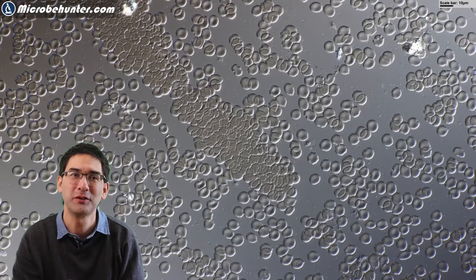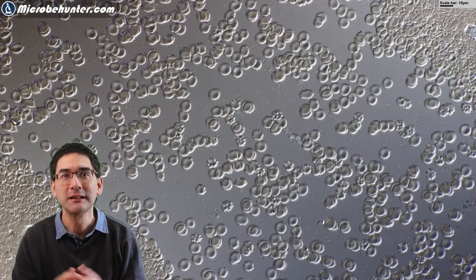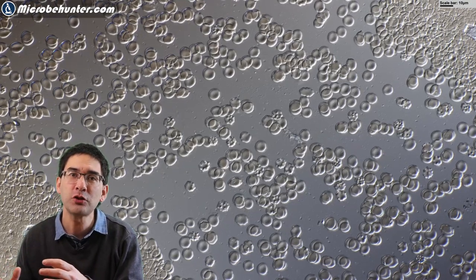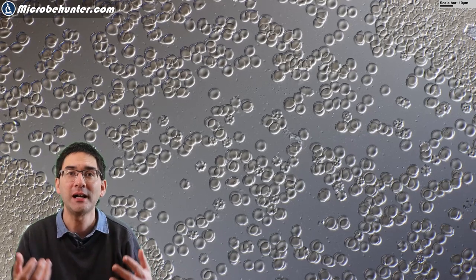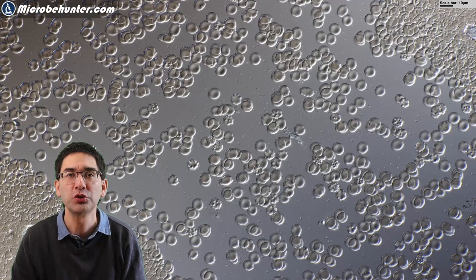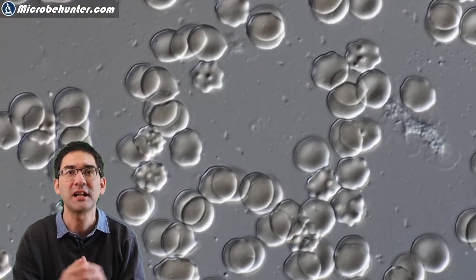In the center, you're able to see that some of those red blood cells already start to stick together because this blood already starts to coagulate a little bit. Depending on the thickness of the blood layer, some of the red blood cells actually start to move a little bit. And as the blood starts to dry up, this also sometimes causes a little bit of motion and movement, which is almost similar to when the blood is actually flowing.